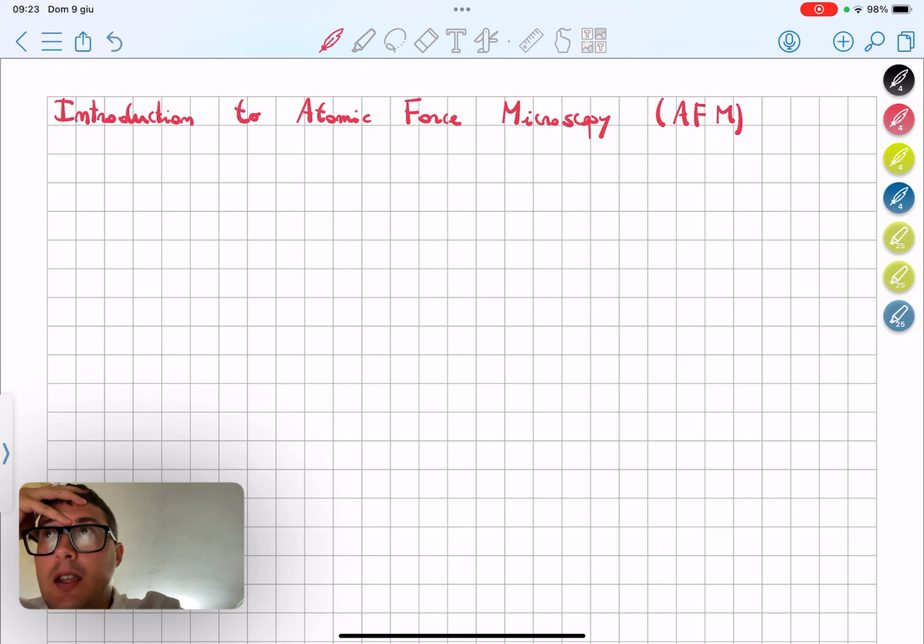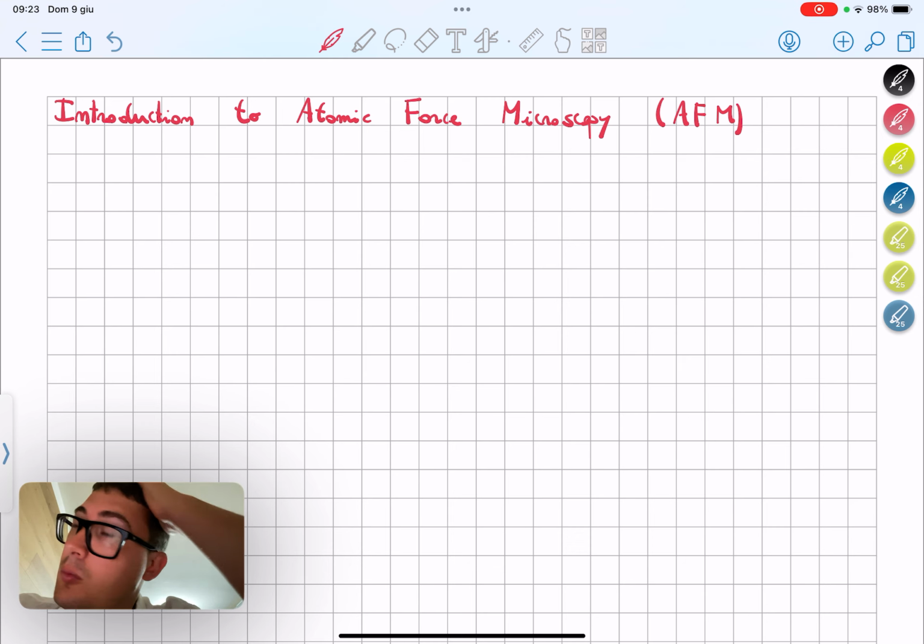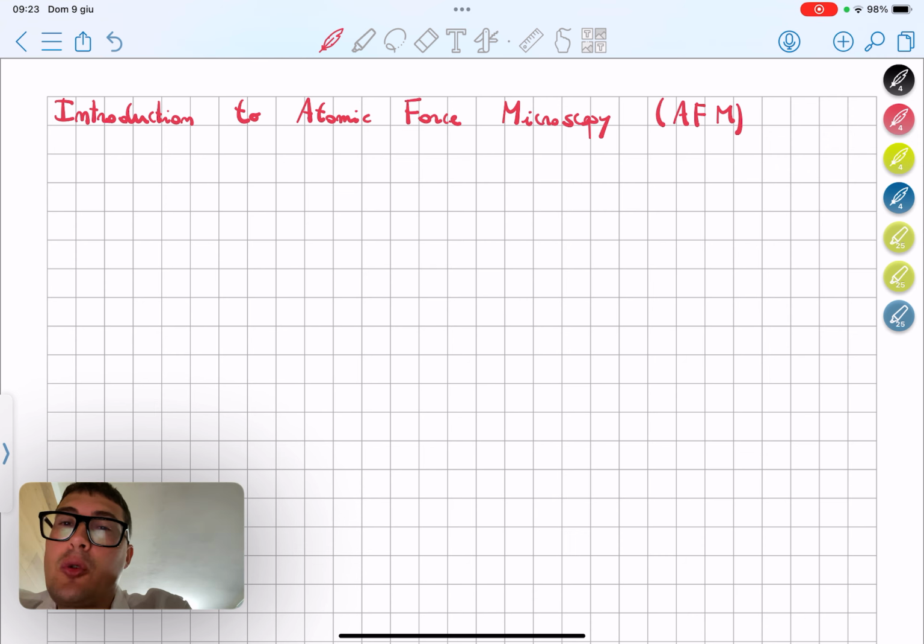After having seen what vacuum technology is and how we make the vacuum, we will see one of the applications, which is atomic force microscopy. Of course, this video is going to be just an introduction to the broad topic. AFM is quite a recent technique, maybe started in 1986 or so.